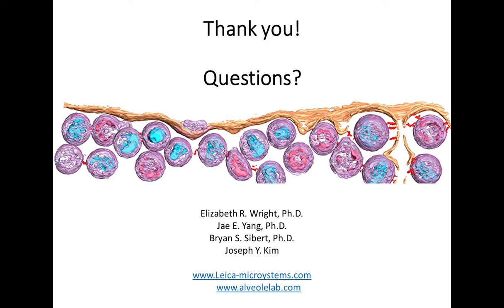But in thinking more expansively, if we are patterning the grids and encouraging the cells to grow in particular arrangements, we can think about how to incorporate microfluidics so that we could gently transition the media that the cells are culturing in. We'd have to develop novel platforms to put the cells on in microfluidic chambers so that we could do time course experiments of transitioning culture media to some other agent to see how this changes cell ultrastructure in response to the changing physiological environment.